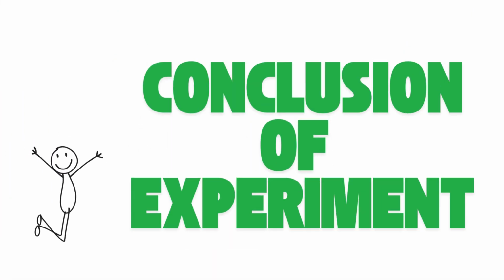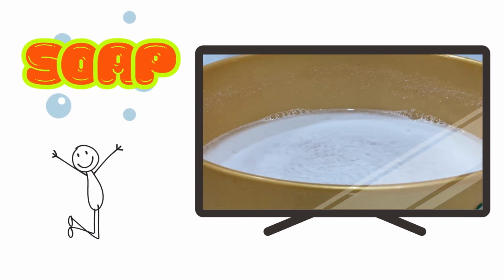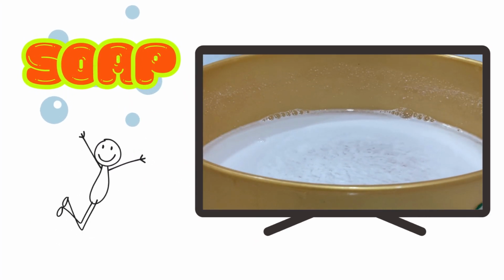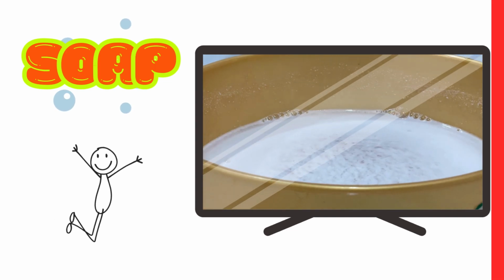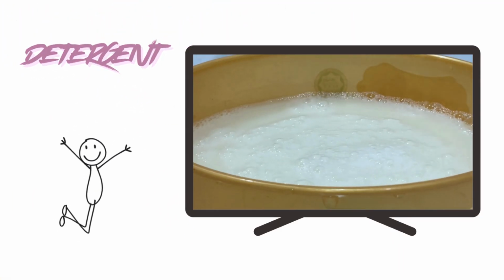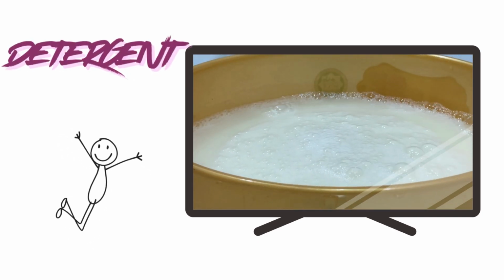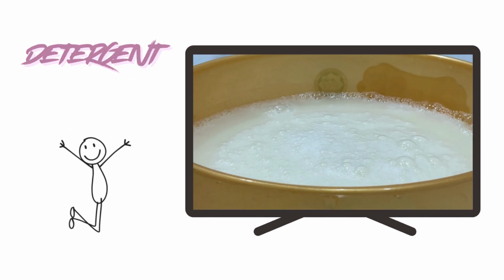Now that we are done with our experiment, let us see the conclusion. As we can see, scum is formed in this solution. Why? Because soap is less effective in hard water. Meanwhile, when detergent is mixed with hard water, it does not form scum. It forms bubbles instead. This is because detergent is more effective in hard water.